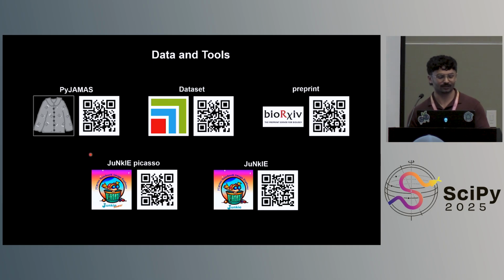Currently ReSCU Nets only look at the immediate previous time point, because for most segmentation tasks that we have, if we're imaging with a good enough temporal resolution, you really only need to see where the object was just before you took the current image in order to know where the object will be. I believe that if you gave it more temporal information, the network is quite good at recognizing which objects are which. So potentially, if that temporal information is complex, then the network would be able to use that to tell which cell is which, if that was the question.